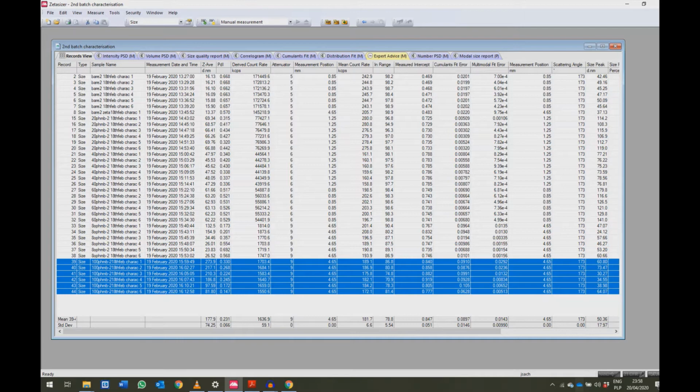And it's your responsibility to be able to make sense of this information. Those parameters are described in that file that I've sent you. Obviously, you can't really reference it in your report. You should go and find literature that discusses those parameters. But in essence, for example, the general rule is that the in range should be above 90, it's 90%. So those that are below 90, all these are potentially of poor quality.